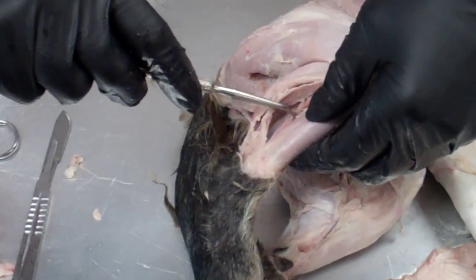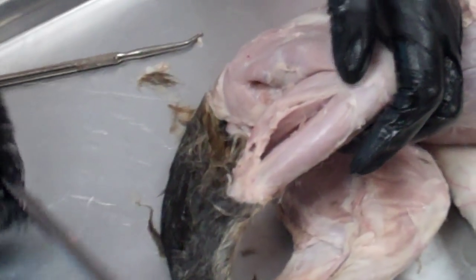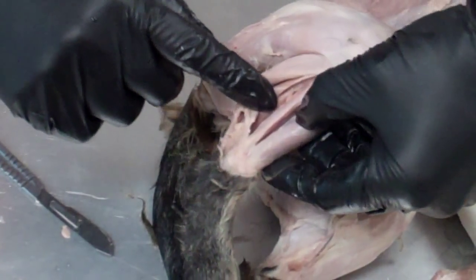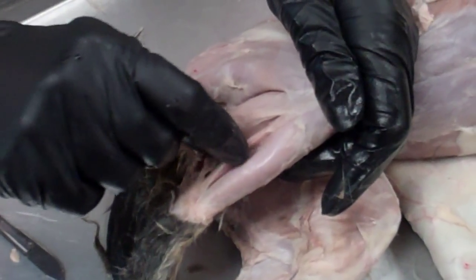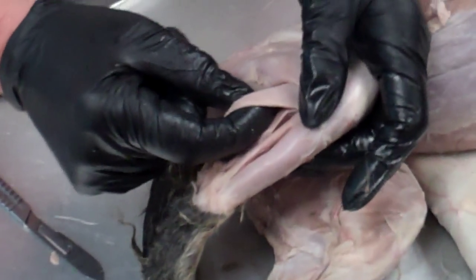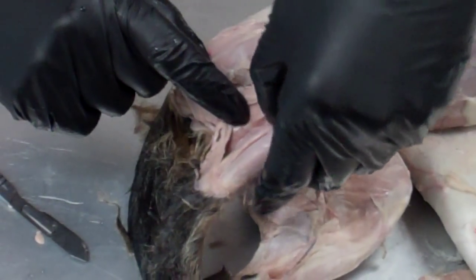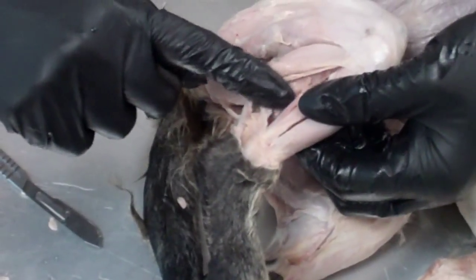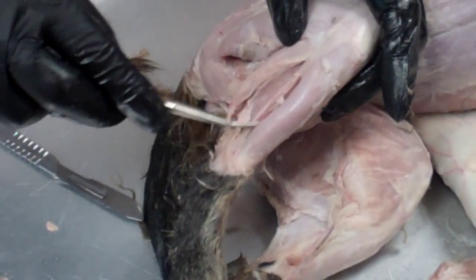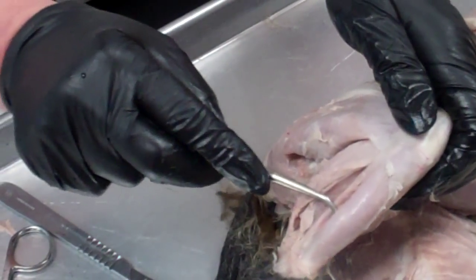This muscle here is the peroneus muscle. There is also a muscle that runs down the side of the leg — this muscle is the extensor digitorum longus. So to review: in the back you have the gastrocnemius, then the next muscle is the soleus, then the peroneus, then the extensor digitorum longus, and on the front of the tibia is the tibialis anterior.